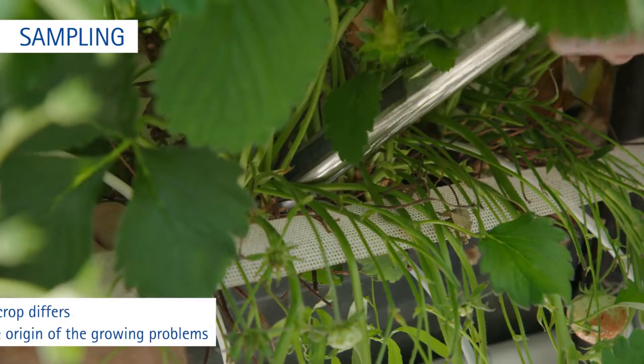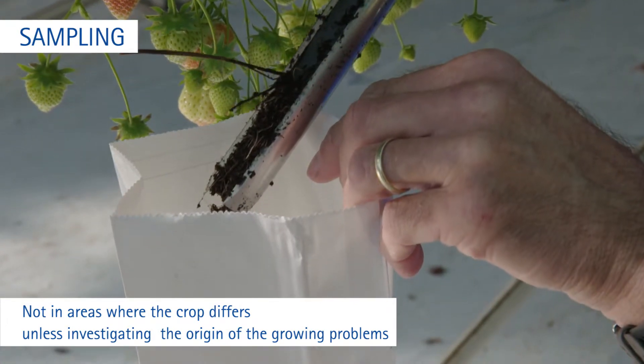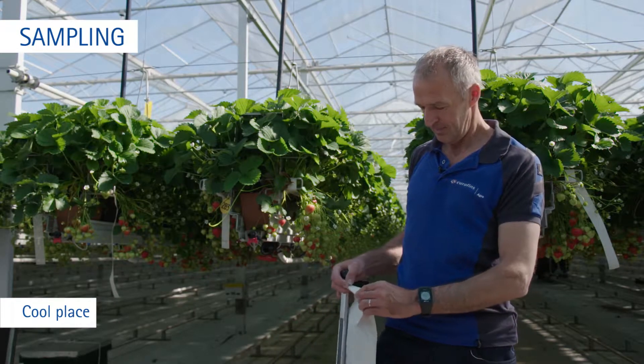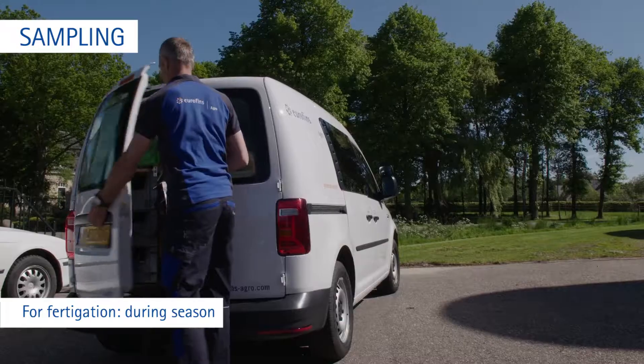Do not take samples in areas where the crop differs from the general planting, unless it is to investigate the origin of the growing problems. Store the samples in a cool place until they are sent. Take the samples for fertigation during the season.